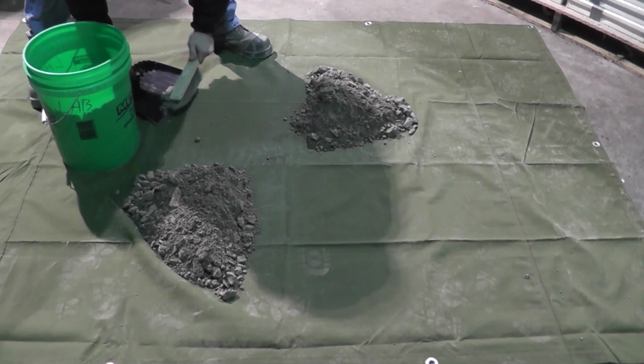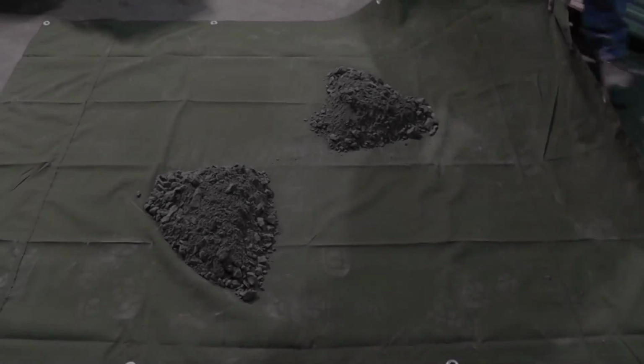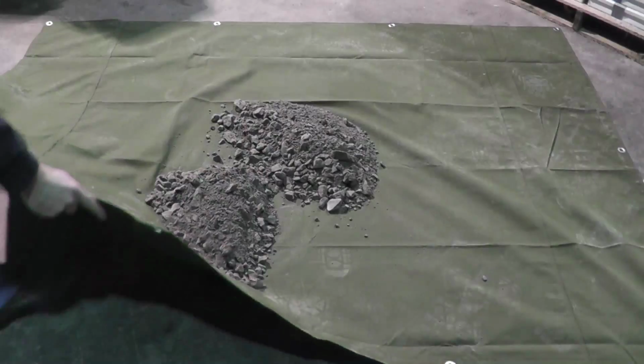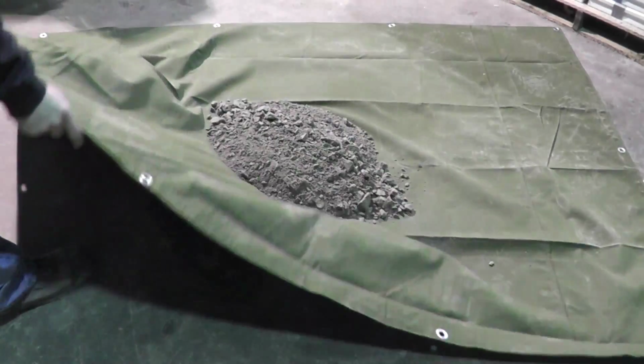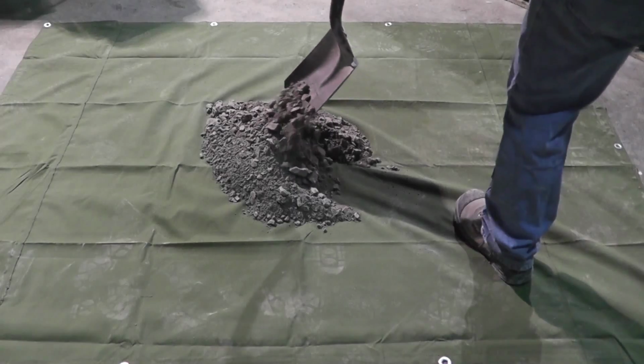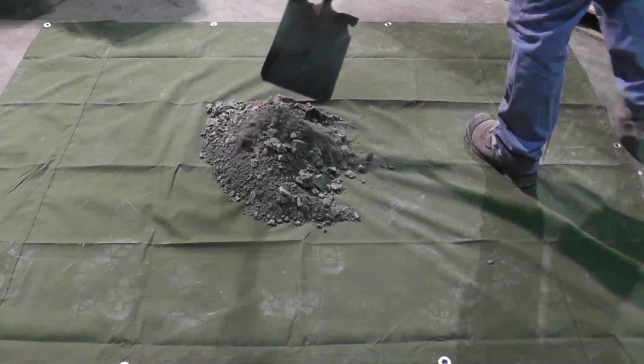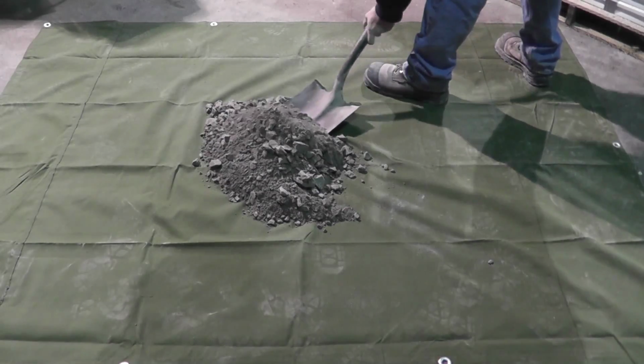Brush the cleared spaces clean. Successively mix and quarter the remaining material in the same fashion as the original sample. Continue this process until the desired quantity is obtained. Save the unused portion of the original field sample until all testing is completed in case a retest is needed.